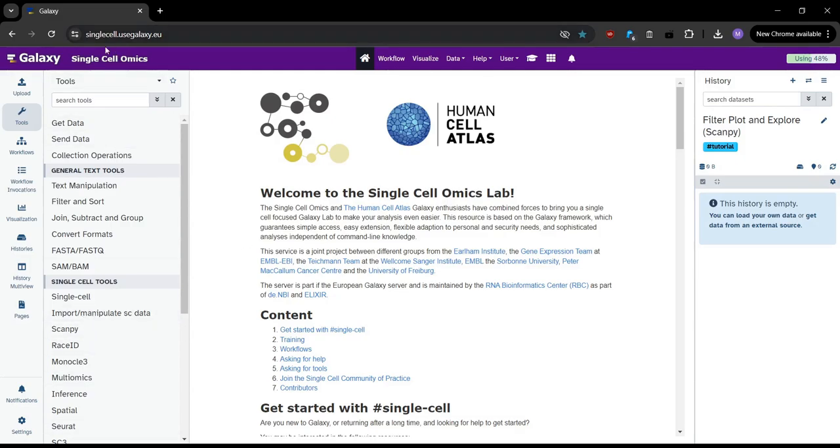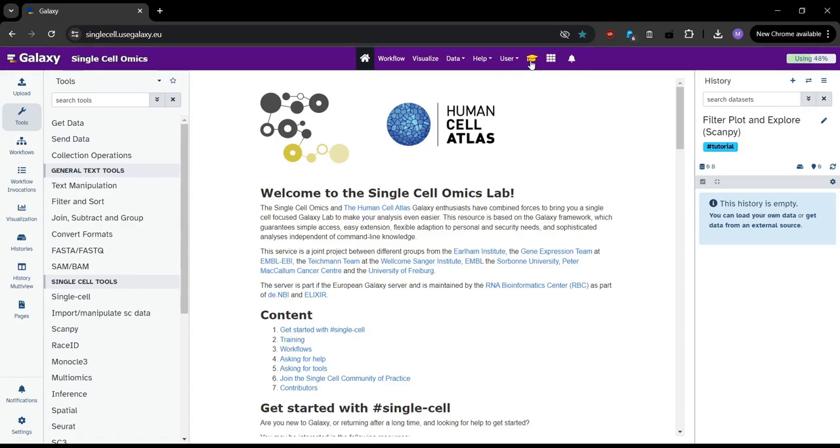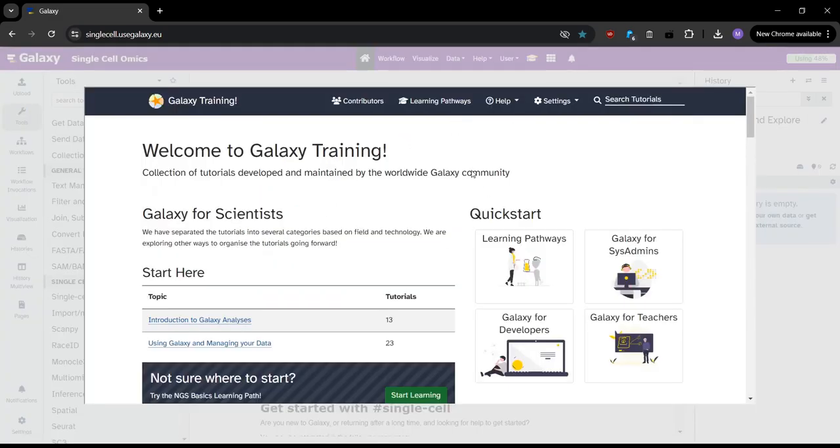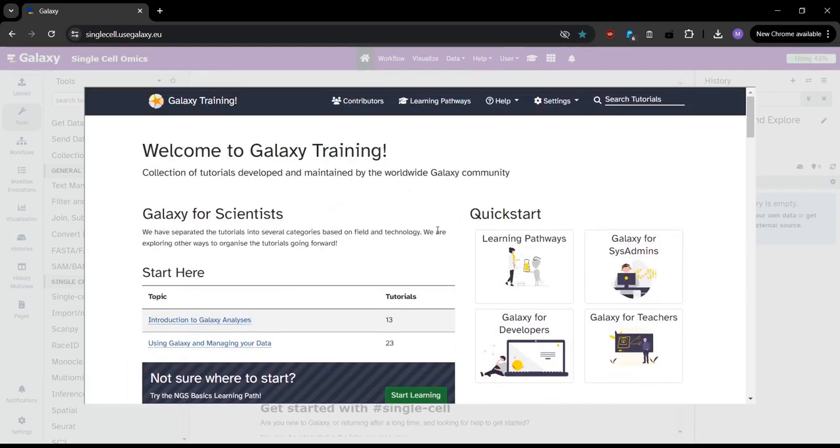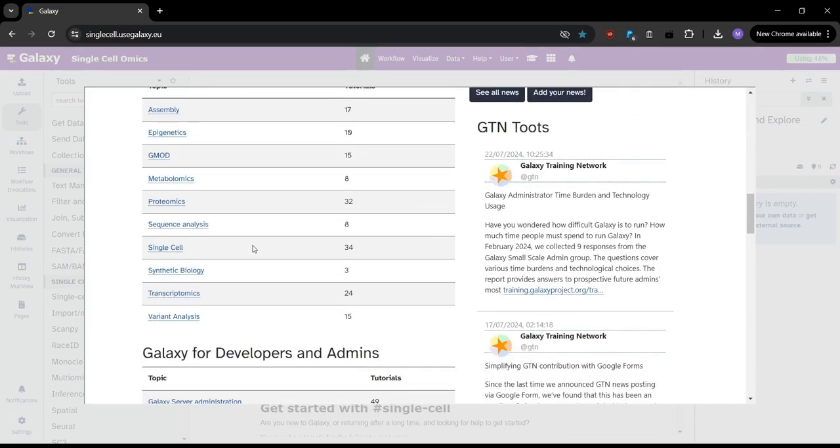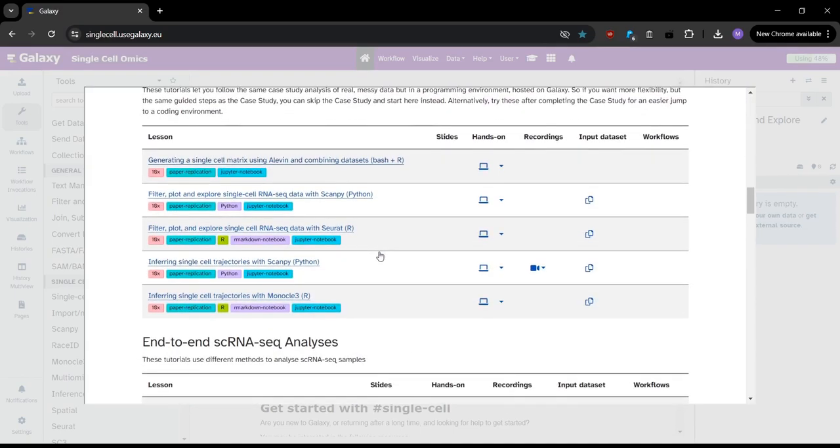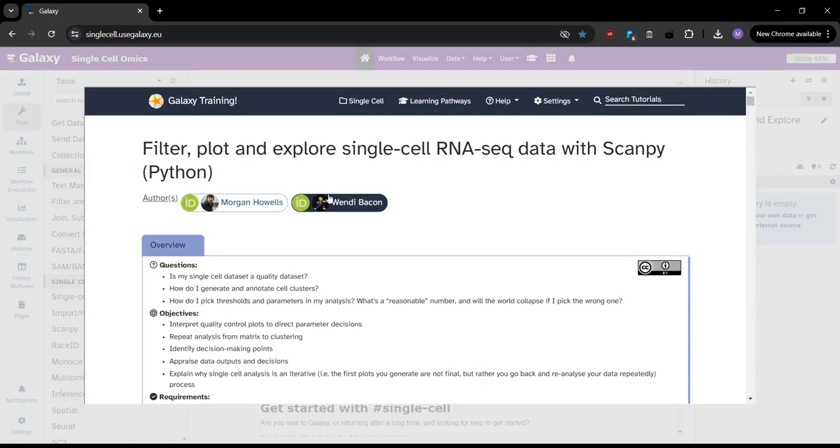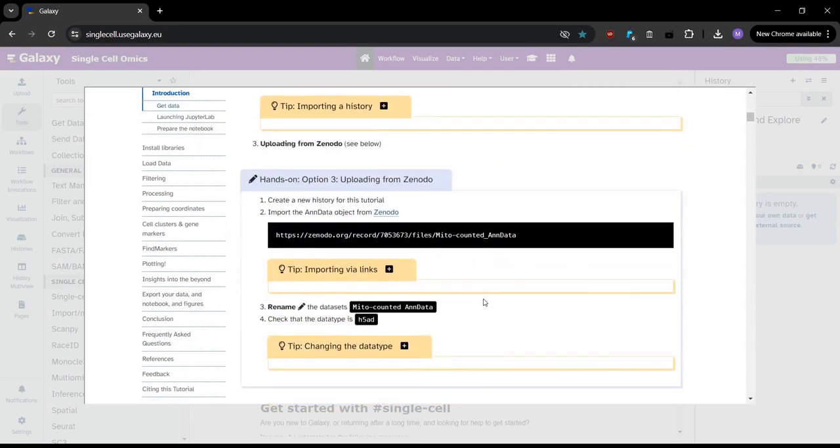So for today, I'll be using the single-cell Galaxy server, because I may do single-cell analysis, but any of the servers will work, .eu, .org, any of them will work for today, it won't matter. So I already have a history created here, so we just need to open up the Galaxy Train Network tutorial. We can either do that in the separate Galaxy Train Network website, or we can use tutorial mode in Galaxy. So if you click on this icon here, it opens up the GTM website in our same tab. We can then scroll down and go to single-cell, and then we can locate our tutorial that we'll be going through today.